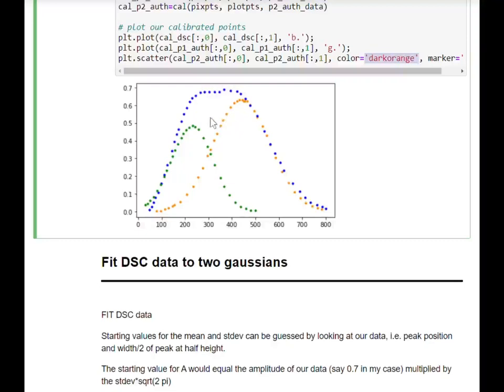And then once I get these two, I can add them together and then compare to the blue data points to see how well their fit really was. We can also fit the blue directly ourselves with 2 Gaussians and see how our fit compares to these 2 peaks that they used. All right, but I have all my data, and now I just need to focus in on the fitting.